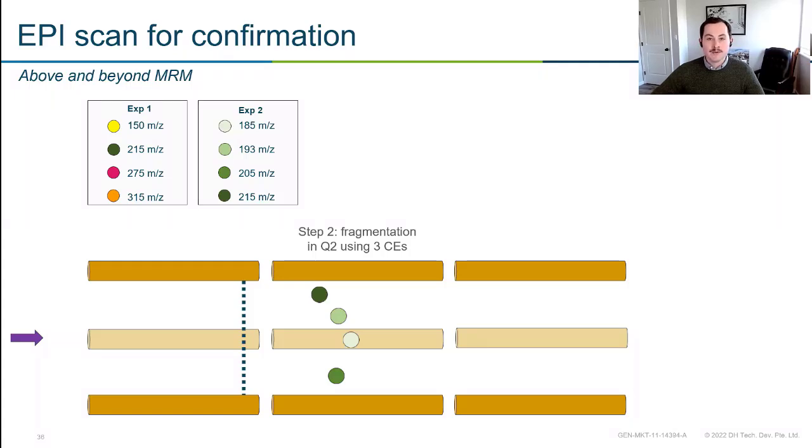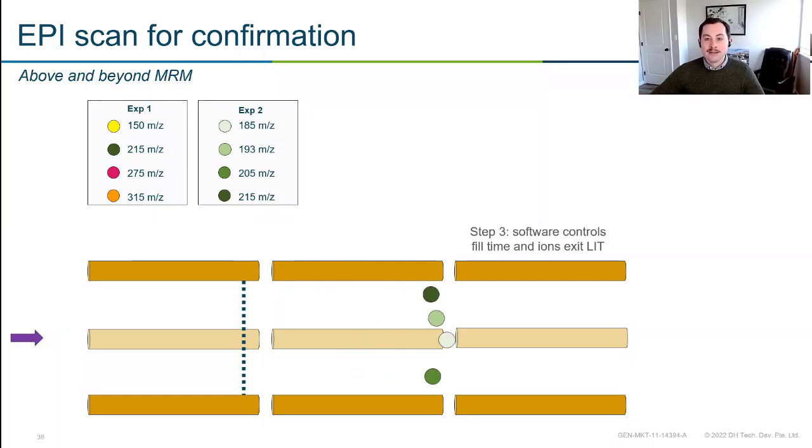And the reason we're doing this is to create a wide range of fragments. So we want as many unique fragments as we can get. So this is a nice way of doing that. Past there, we're going to allow those fragments to fill up the ion trap and then be read out by the software. And as those exit, they'll reach the detector and we'll get their masses. And this will give us the compound's, I like to call it again, fingerprint.